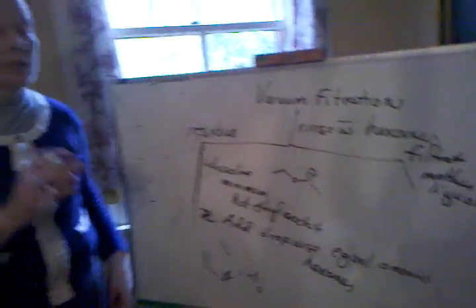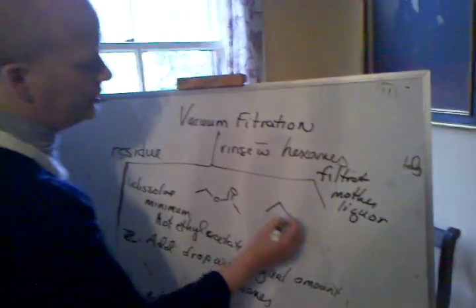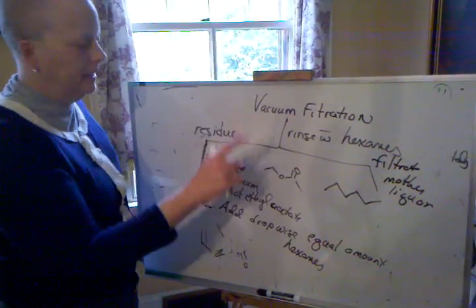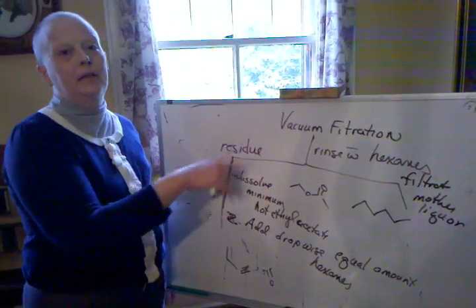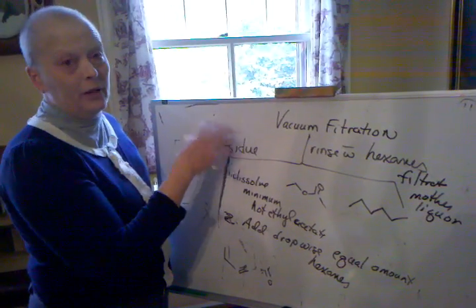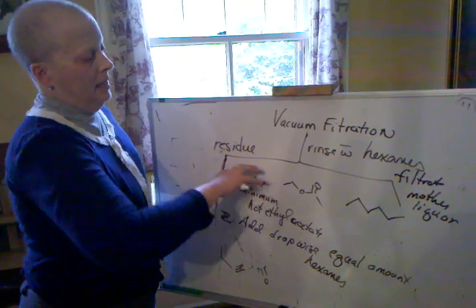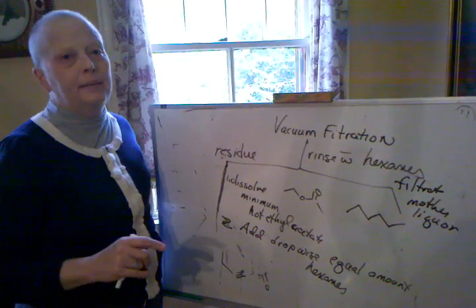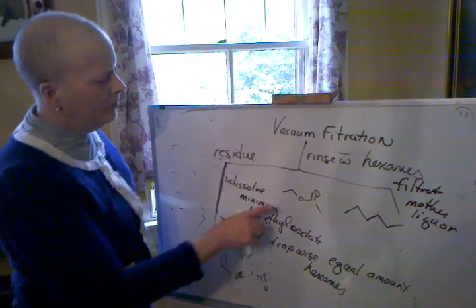Okay, now think about what this is going to do. Hexanes are just a mixture of 6-carbon alkanes. These are very nonpolar, this is very polar. So the idea here is we're going to take this compound that has a decent dipole moment, get it completely dissolved in hot ethyl acetate. If it has any little contaminants in them, we'll filter them out.